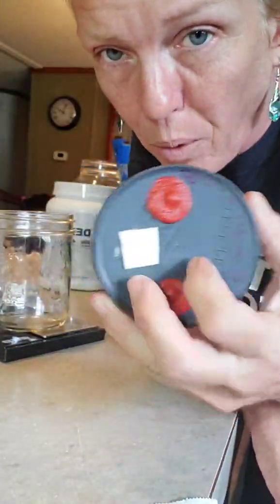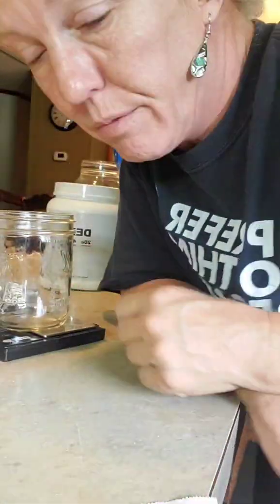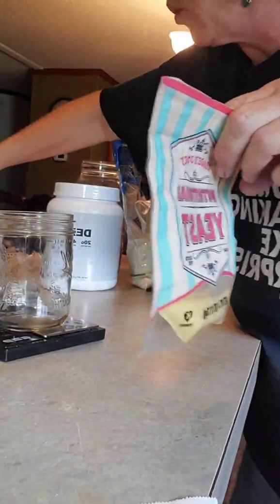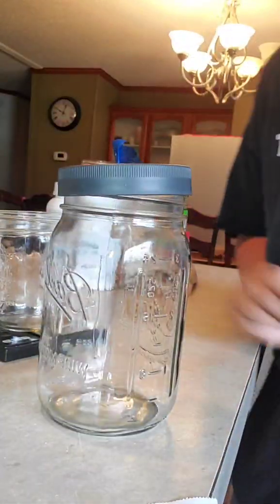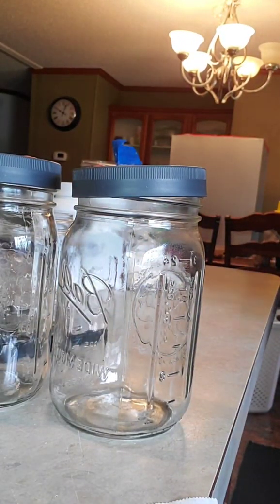So, we've got our tinfoil, we've got our lids. Yes, these are injection port lids, but they work fantastic to sterilize agar. Let me get my jars that I don't need. This lid needs to go on here so we don't have issues with that. These are my jars that I'm using, okay? Actually, I should probably run 4.